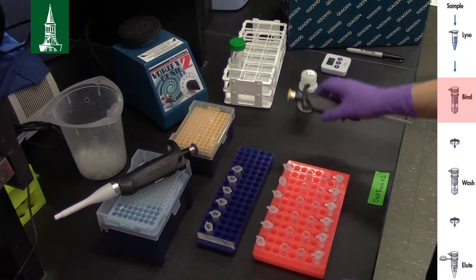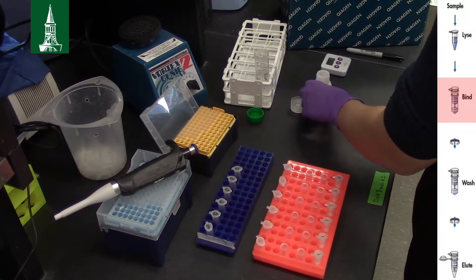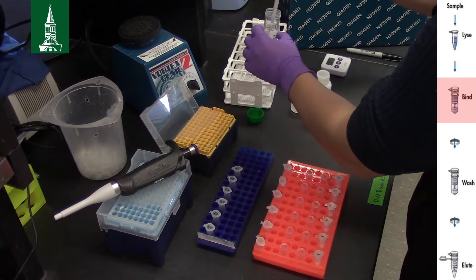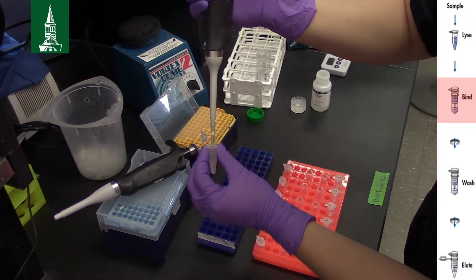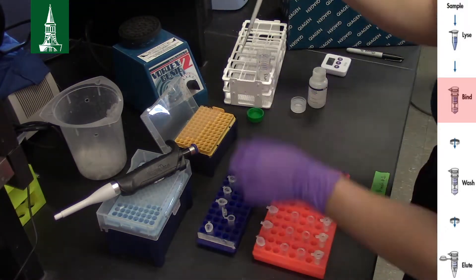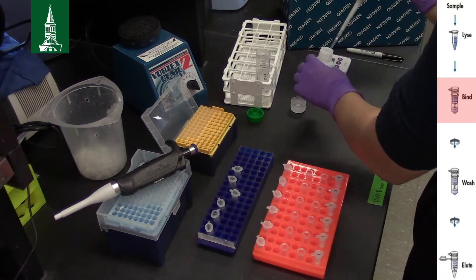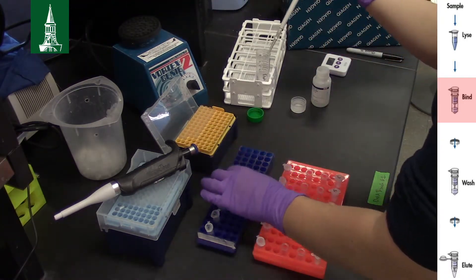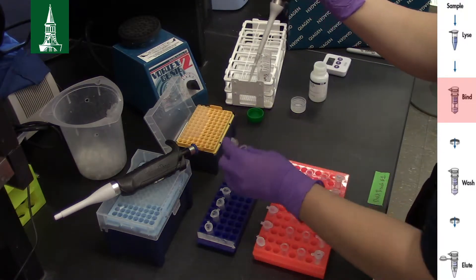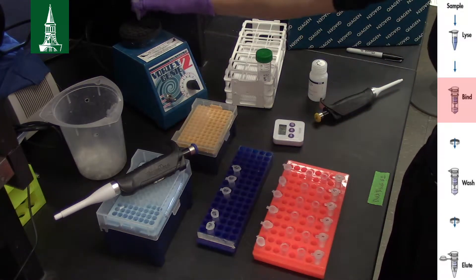Add 200 µl of buffer AL and 200 µl of 100% ethanol. Mix again thoroughly by vortexing. A white precipitate may form — this is normal.